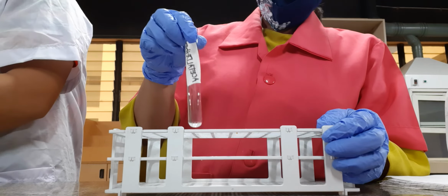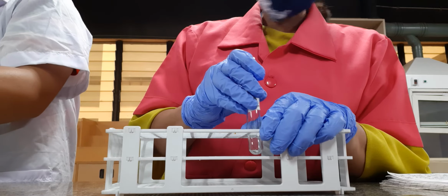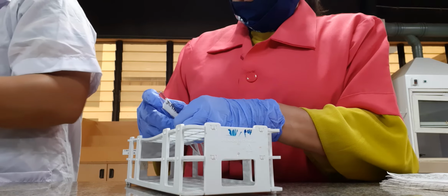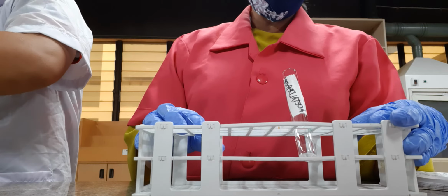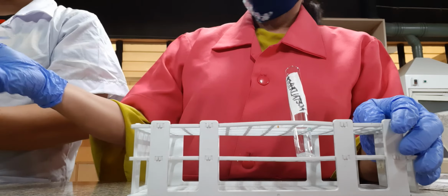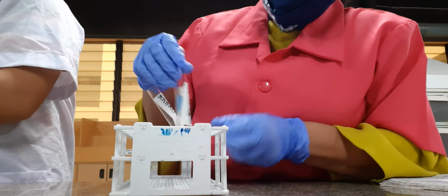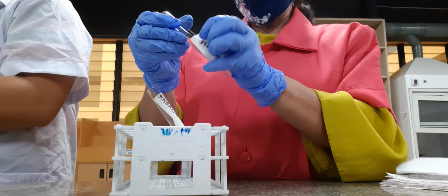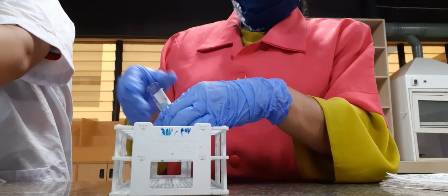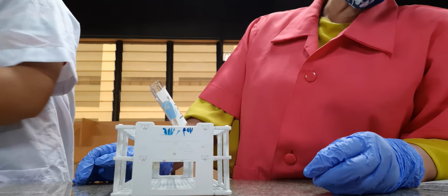We have acetaldehyde, and the next is acetone. And next is benzaldehyde.